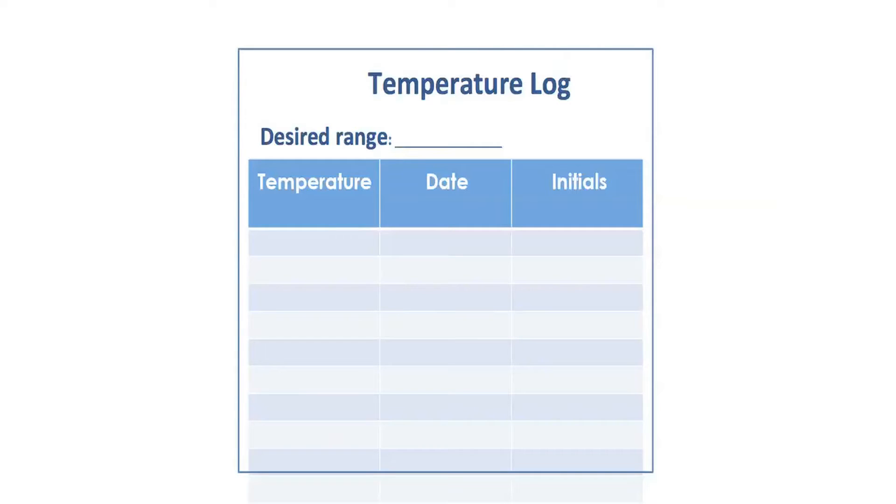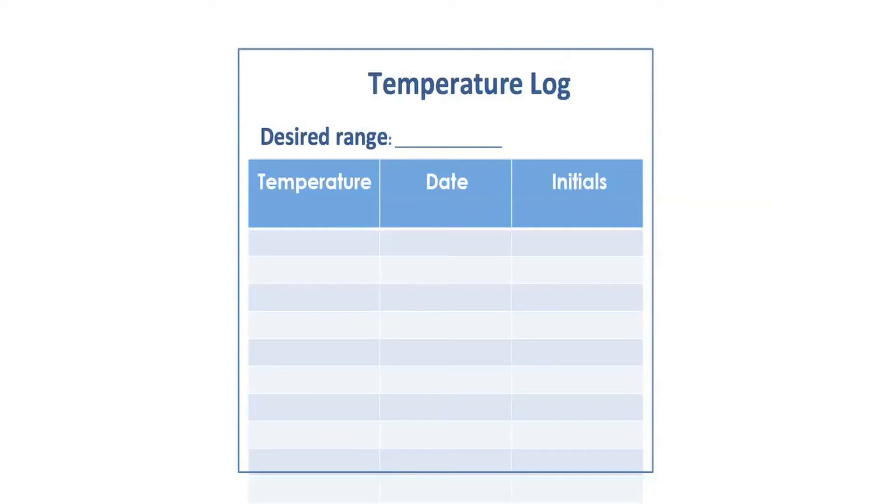That works great most of the time because temperatures are usually within range. However, one of the commonest CAP citations, if you see any inspection report, is temperature being outside and no action being documented. We used to have the same problem.